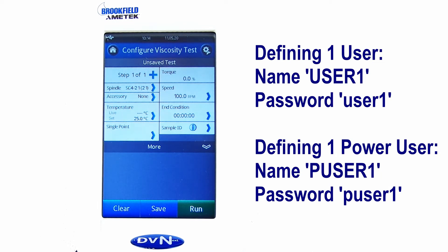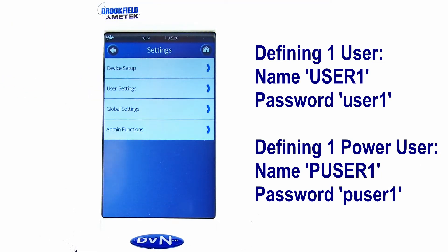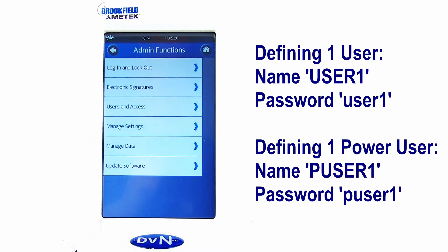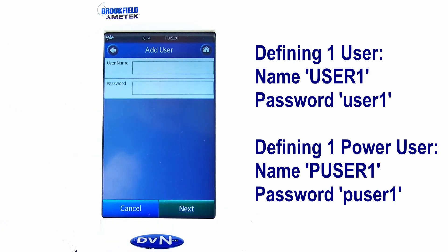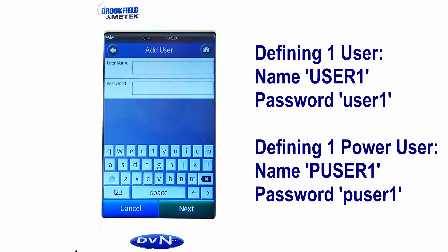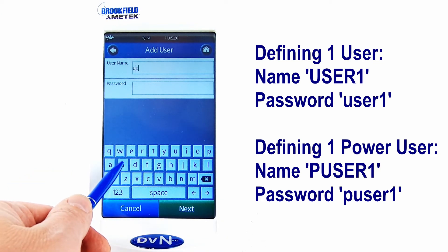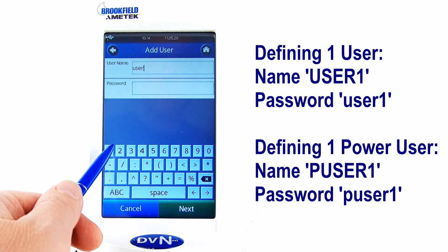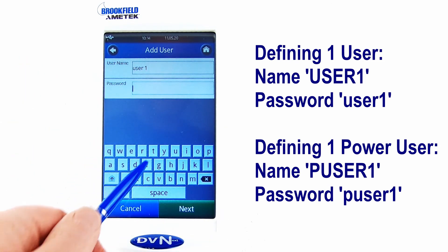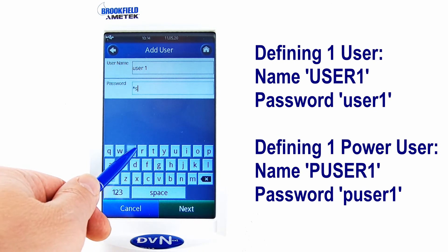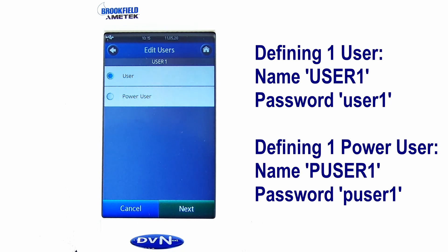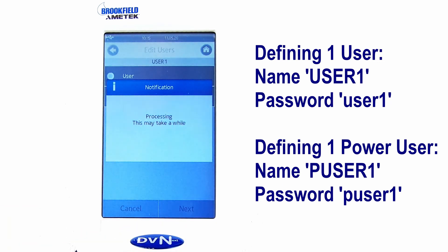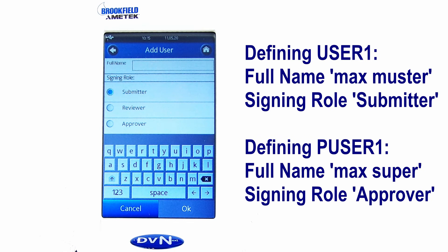Now we are defining a user and a power user to be prepared for electronic signatures. For each added user, you have the choice between user or power user, or regardless of the user, starting electronic signatures between submitter, reviewer, or approver.